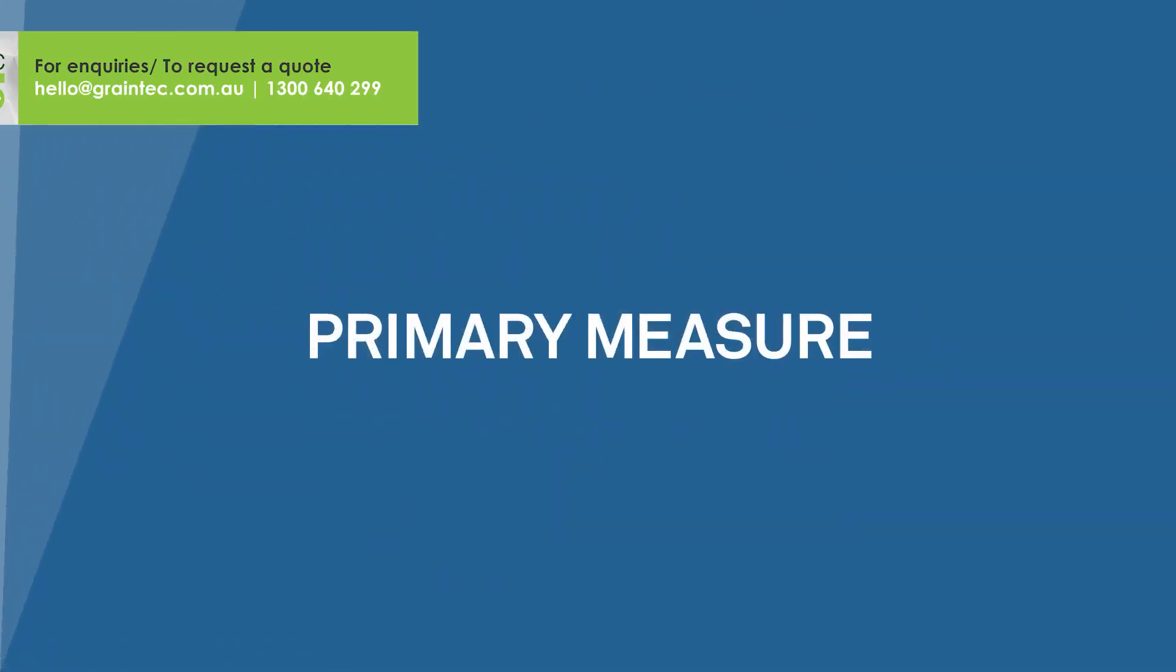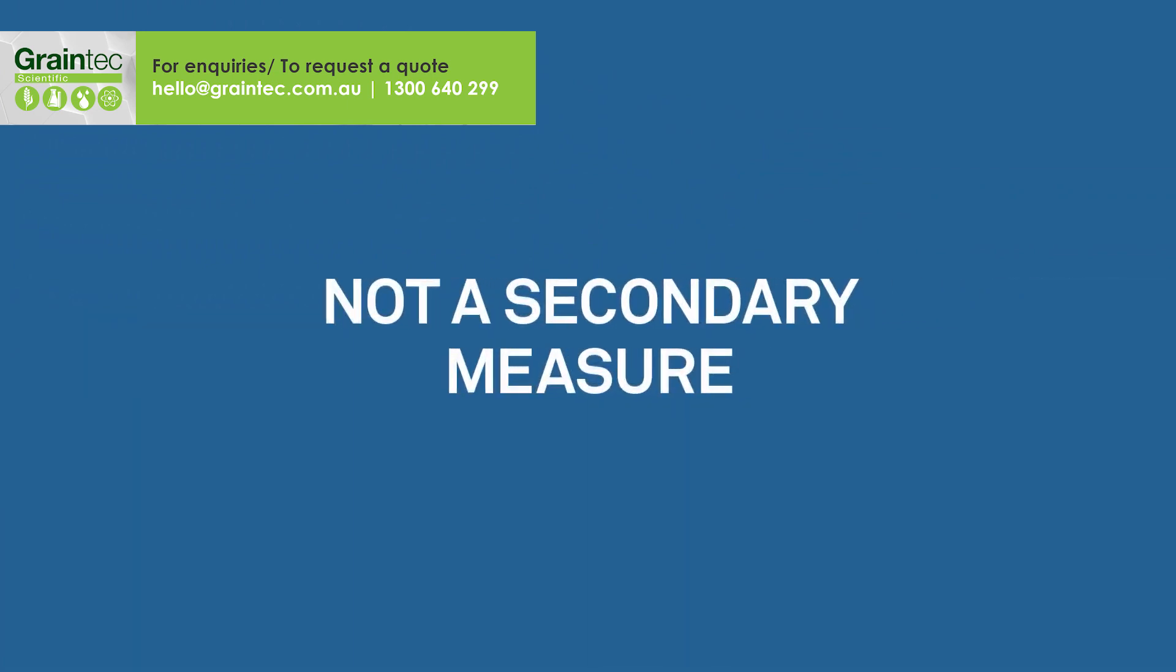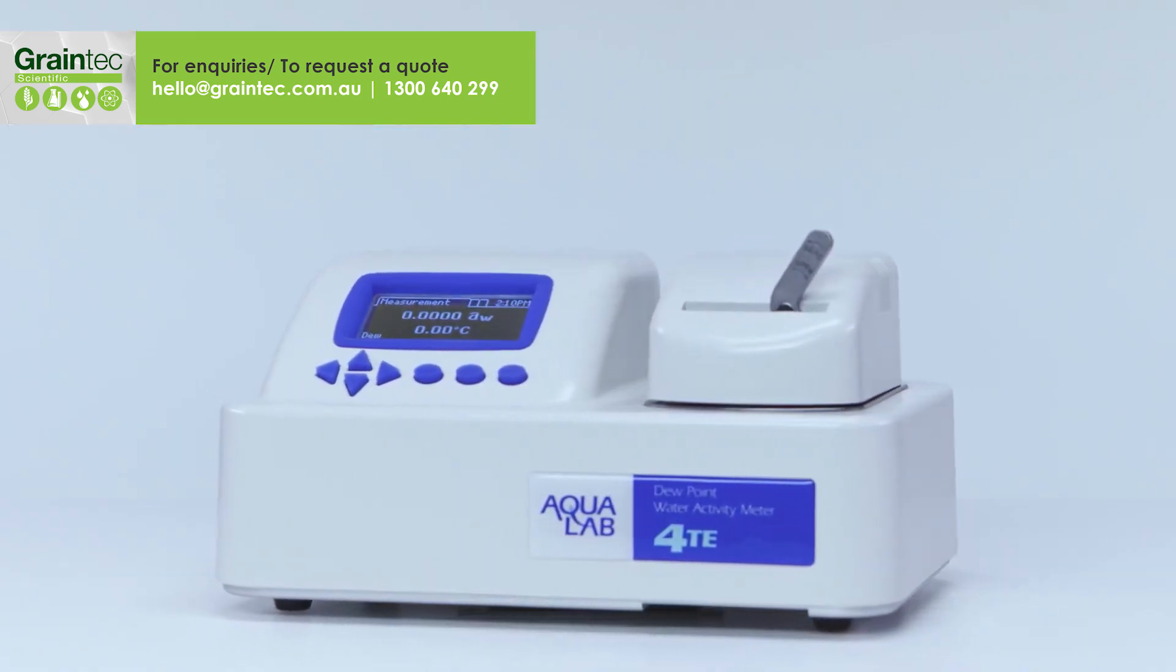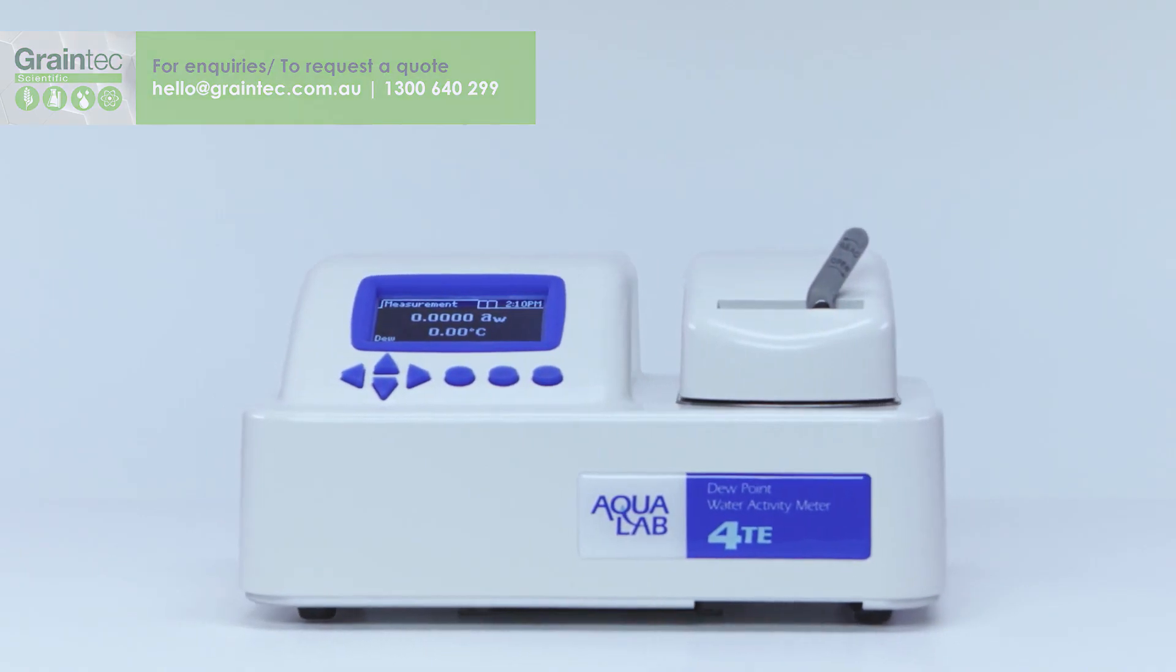You get speed plus accuracy because the Aqualab 4 TE actually measures water activity, not some secondary parameter correlated with water activity. The Aqualab 4 TE water activity meter. Speed and accuracy by measuring the real thing.